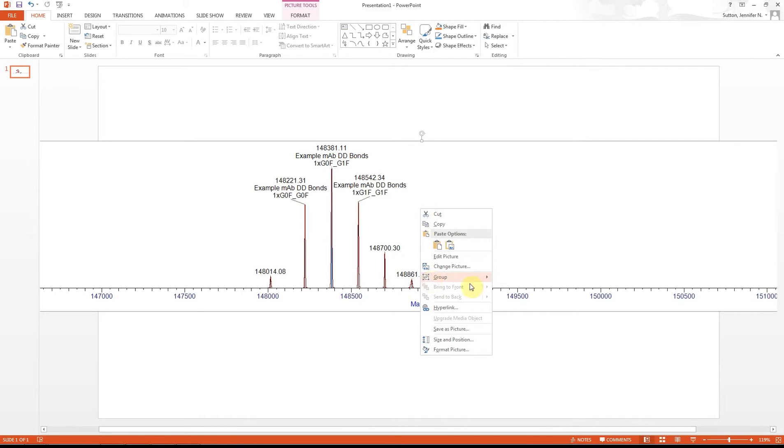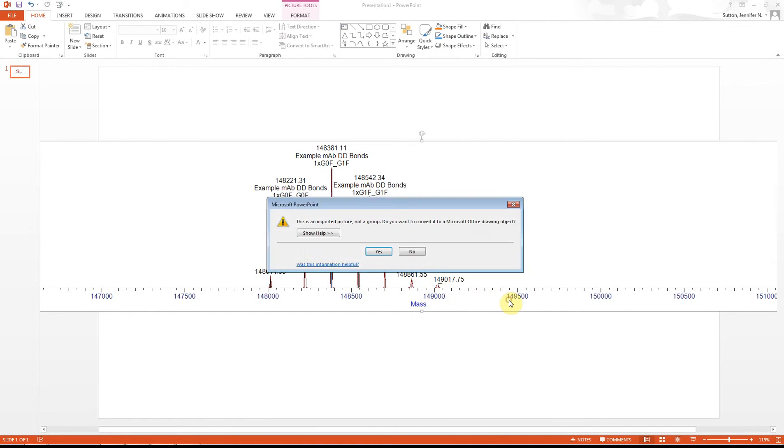select Group, you can now ungroup it. When you ungroup it, you're going to want to select Yes here because we want to convert it to a Microsoft Office drawing object.